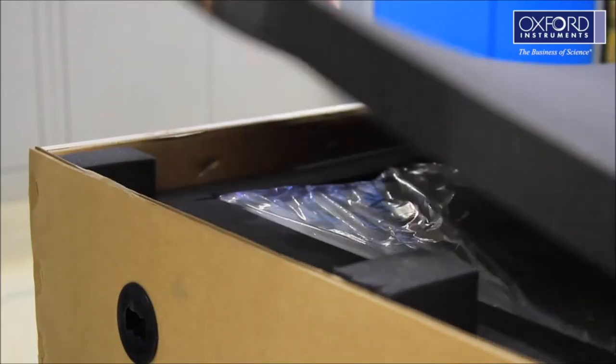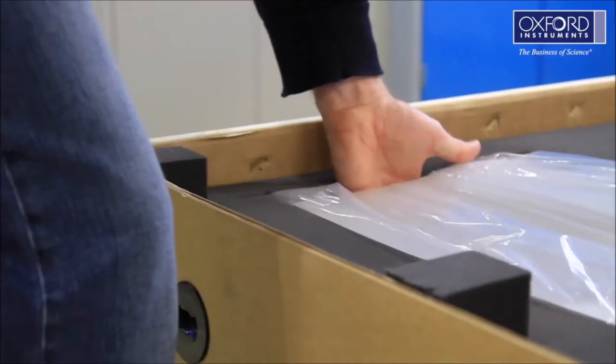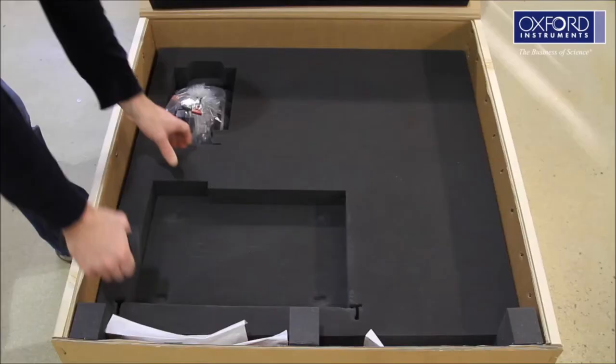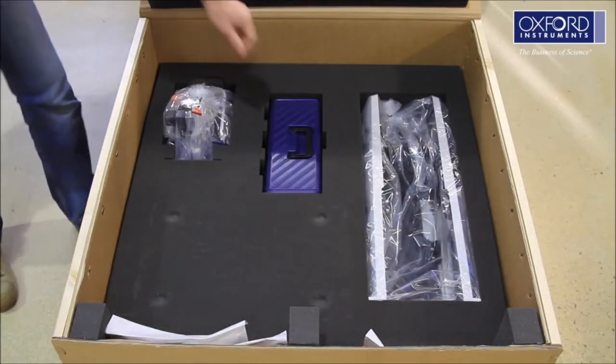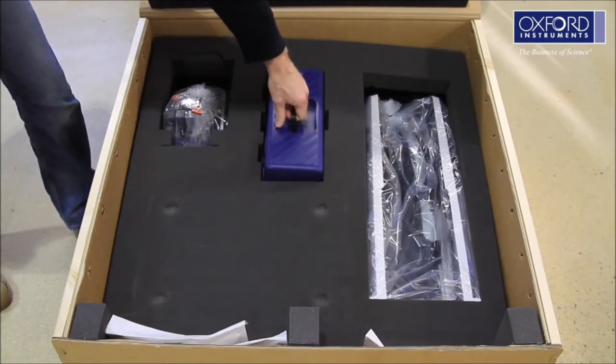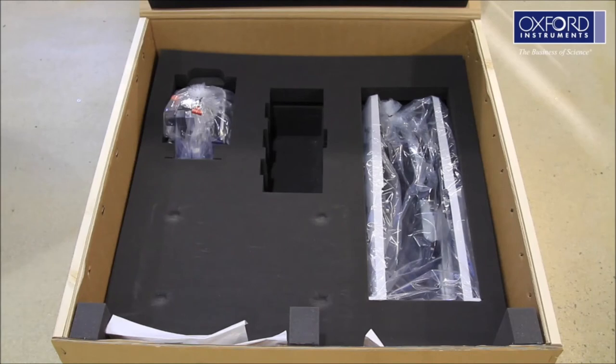Remove the first two layers of foam. Carefully remove the Mercury ITC temperature controller and put it in a safe place. Remove the next layer of foam and take out the toolbox, which contains the optional spurs kit and the other loose items. Put this somewhere safe as you will need it shortly.